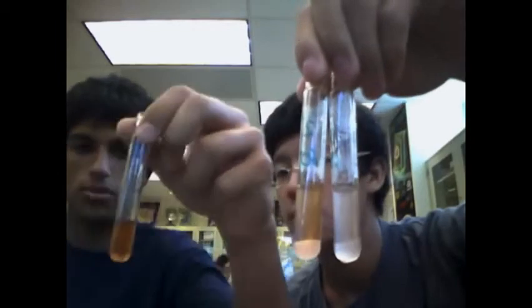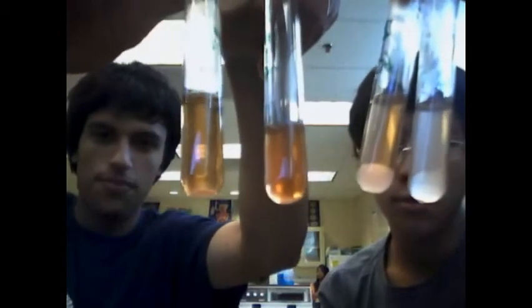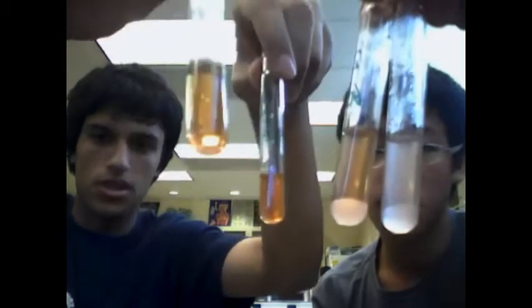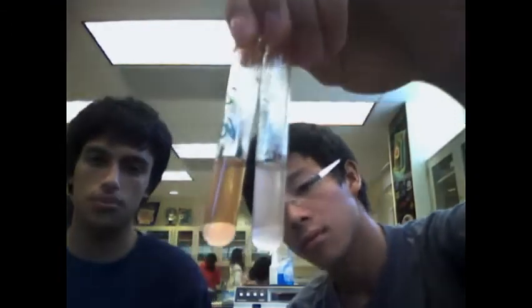So as we compare this to our positive test result, if you could just, there we go. Here we have our positive test result from our first run. Notice the color; they're very similar, meaning that test tube number 1 had a very good positive test result.